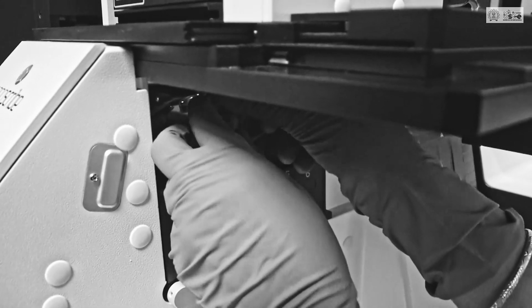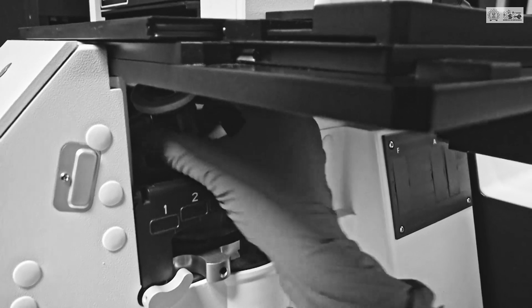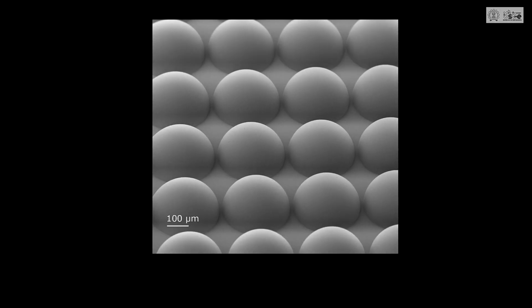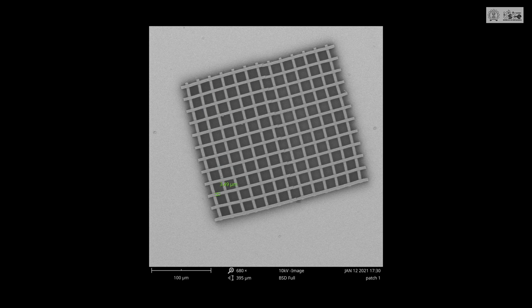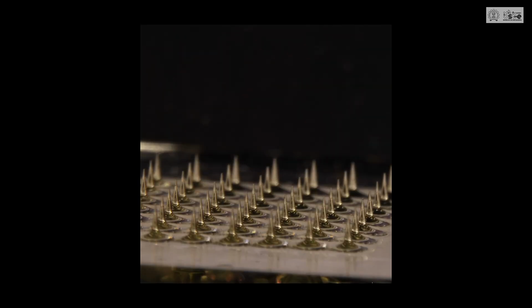precision and resolution, this 3D laser lithography system enables experimentation possibilities in many research fields such as microrobotics, photonics, electrochemistry, microfluidics, tissue engineering, and electronics and material sciences. It has been used for printing microneedles and microfluidic channels.